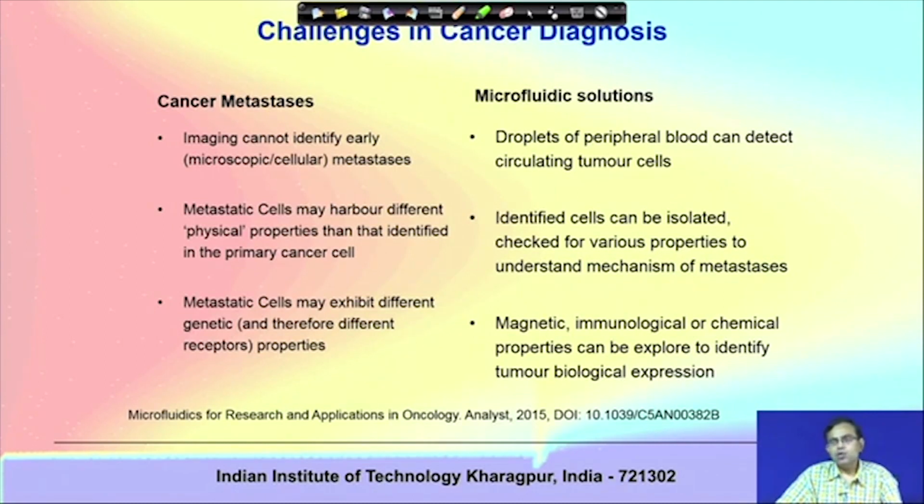So, during this metastasis, circulatory tumor cells are shed in the bloodstream, and currently there is a growing tendency that instead of doing a traditional biopsy, these circulatory tumor cells can be isolated and characterized, and then based on simple blood test, cancer diagnostics for advanced stage cancers can be done.